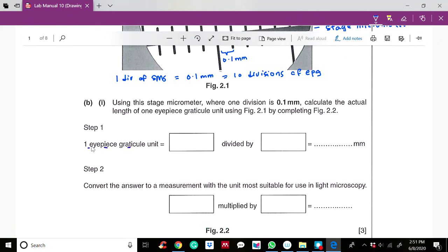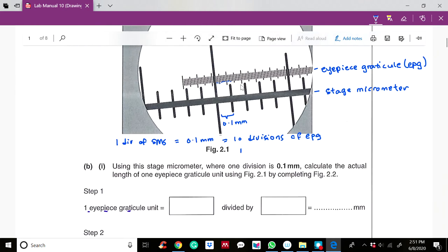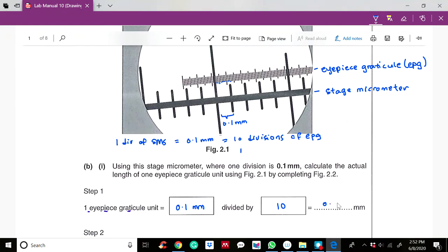Now we can find the length of one eyepiece graticule unit. Since 10 divisions equal 0.1 mm, one division equals 0.1 mm divided by 10, which gives 0.01 mm.